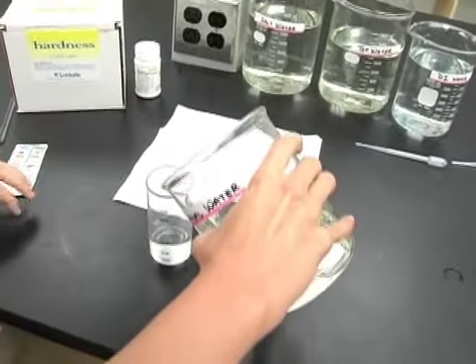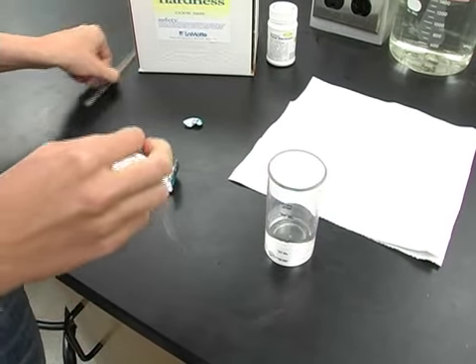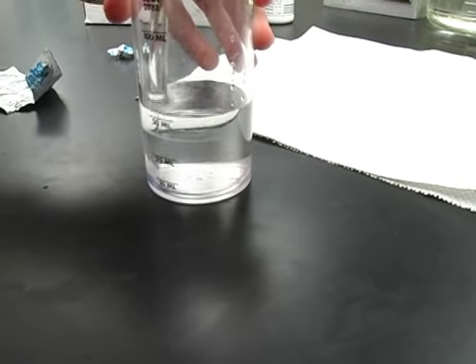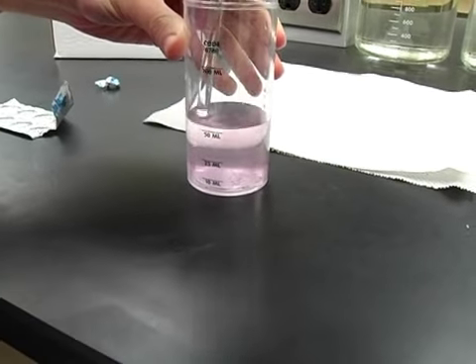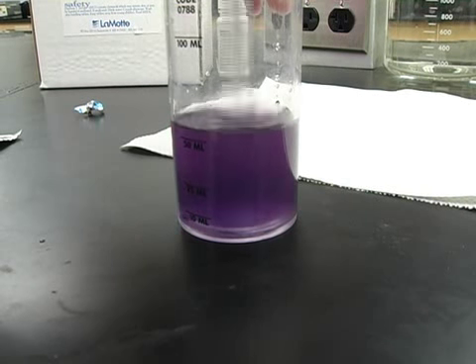For any freshwater sample, such as canal water, fill the test tube to the 50 milliliter line and add the hardness test tablets one at a time, dissolving each completely before adding the next. Stop adding tablets when the water has changed from red to blue. Then, multiply the number of tablets used by 40 and record this number as the ppm total hardness.